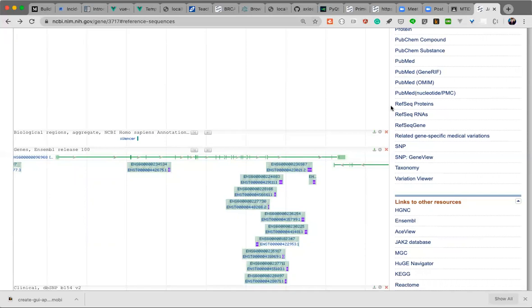And this is a suggestion: if you want to look for the homologous sequence, you should use the protein sequence as much as possible, because nucleotide sequences will not use a metric like the substitution matrices such as PAM or BLOSUM. So it's going to be different. It's much better to use the protein sequence to search for homologous sequences, because as I said in the first class, even if you have a mismatched amino acid, it could still have the same or similar property. So I still get a good score.